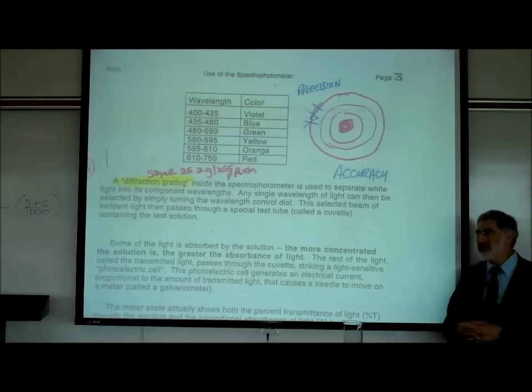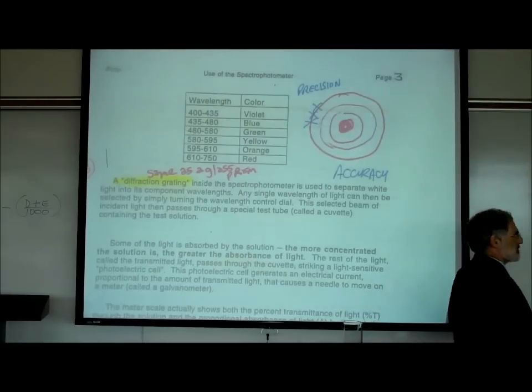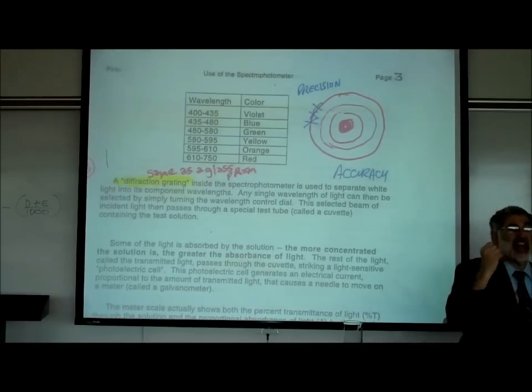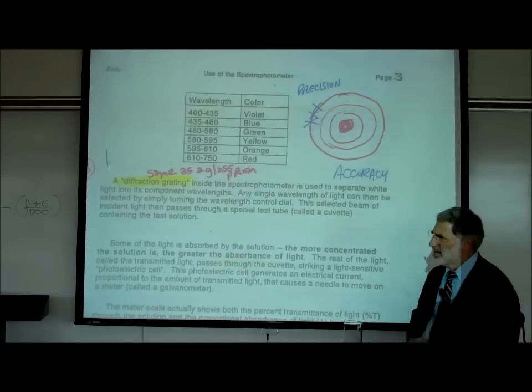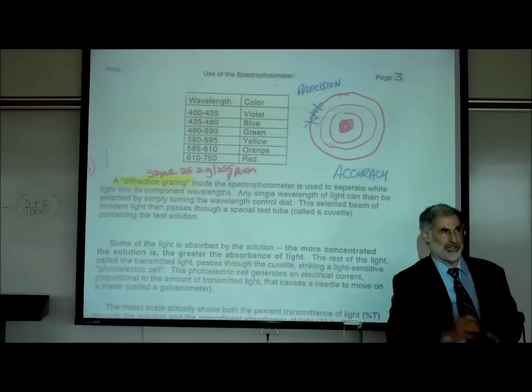So the problem is, these problems that you learn about in a chemistry class are equally applicable to determining sugar concentrations in the blood. That when we run these tests, we have the same problems of both accuracy and precision. What was precision again? Precision is consistency of result.